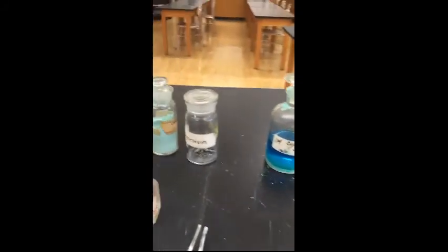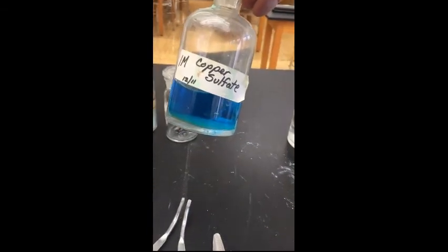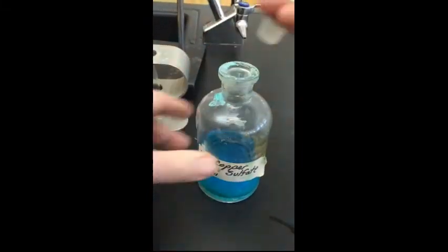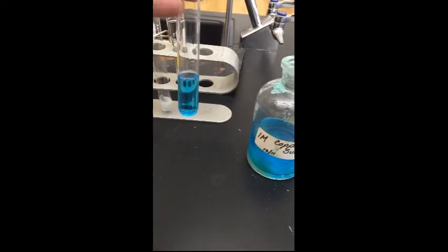Okay, the single replacement part of this lab. I'm going to take 1 molar copper sulfate, and I'm going to put some into another test tube. It's plenty. It's probably a little much, but that's okay.